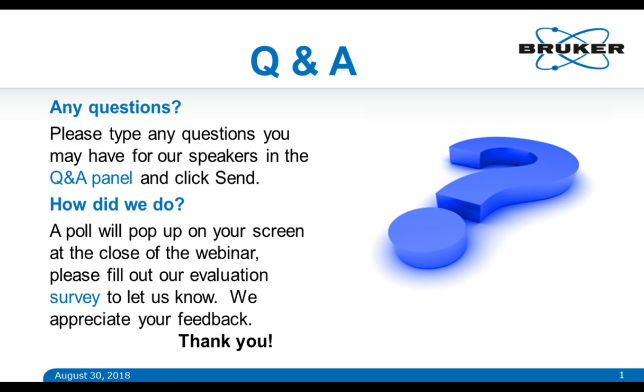Yeah, thank you. Now I also got a question actually to my part, and the question is why is there a difference in quantification between newborns and older children and adults? Well, the reason for that is that in the early days of life, the ionic matrix which the urine represents is quite different from the matrix that you have when children are aging, turning into adults.